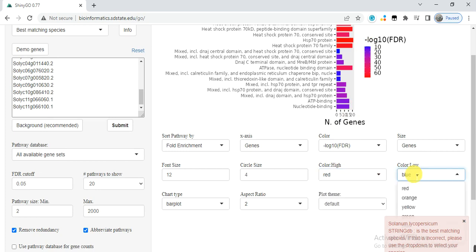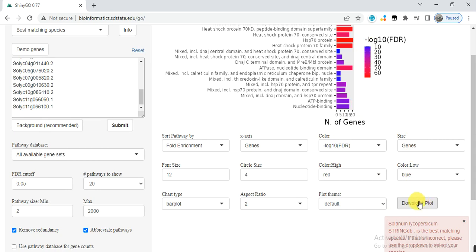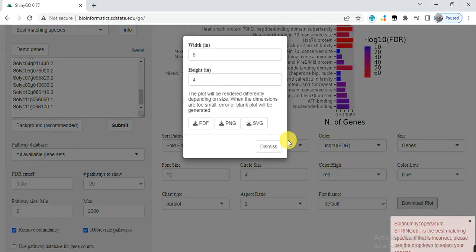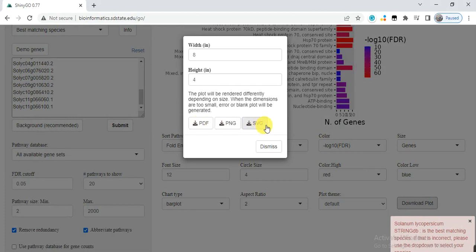You can write the maximum and minimum color—red or blue—you can change it accordingly. Then click here to save it. You can download it in PDF, PNG, SVG, or any other format. You can adjust the width and height of that graph and save it.